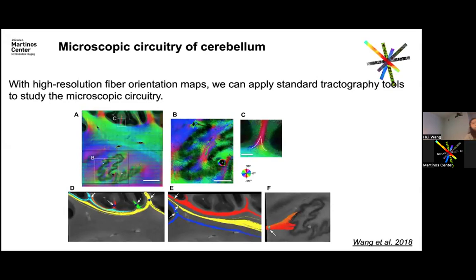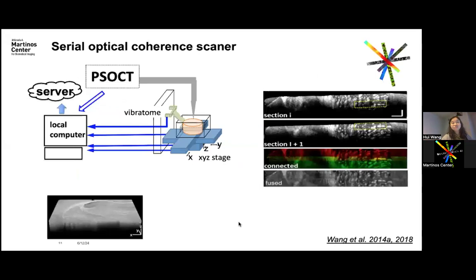Right. So that's the limitation of the traditional PSOCT, and that exactly leads to the discussion of the next part of the work, the 3D axis. But before going to that, so far we're showing one slice, and how to make a large volumetric reconstruction with the PSOCT system.